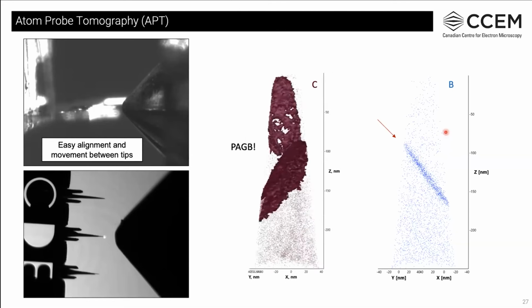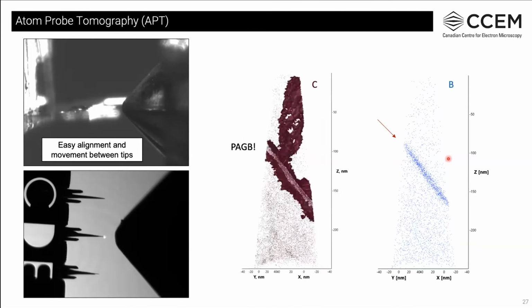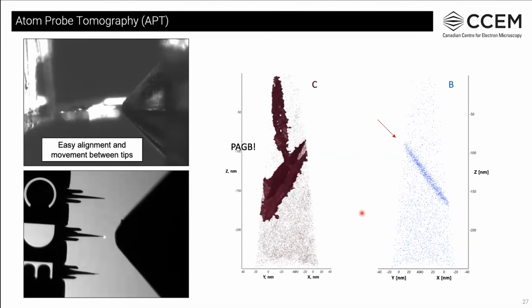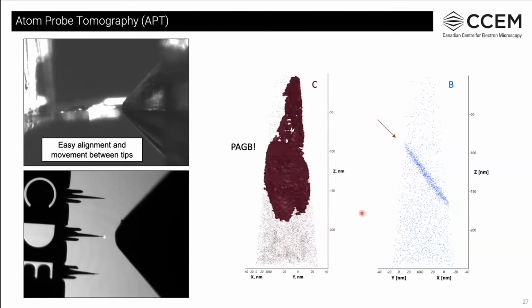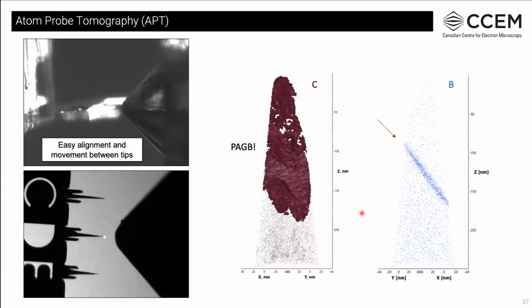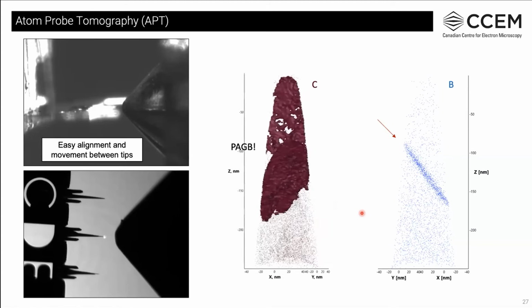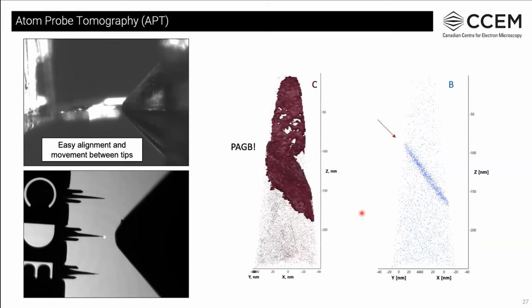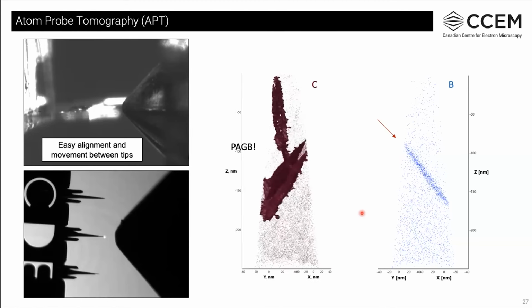And if you recall, I previously said that we need to consider how exposure to the energetic electron beam and carbon contamination can affect the specimen yield. This will likely be material dependent, but in this case, we were lucky and had good yield without a fracture. In the case of poor yield, extra steps, such as an extra low kV cleaning stage in the FIB after imaging, can be used to try to help improve yield. And because our tip didn't fracture, we can move on to post-APT imaging steps in the TEM and take a closer look at our tip.